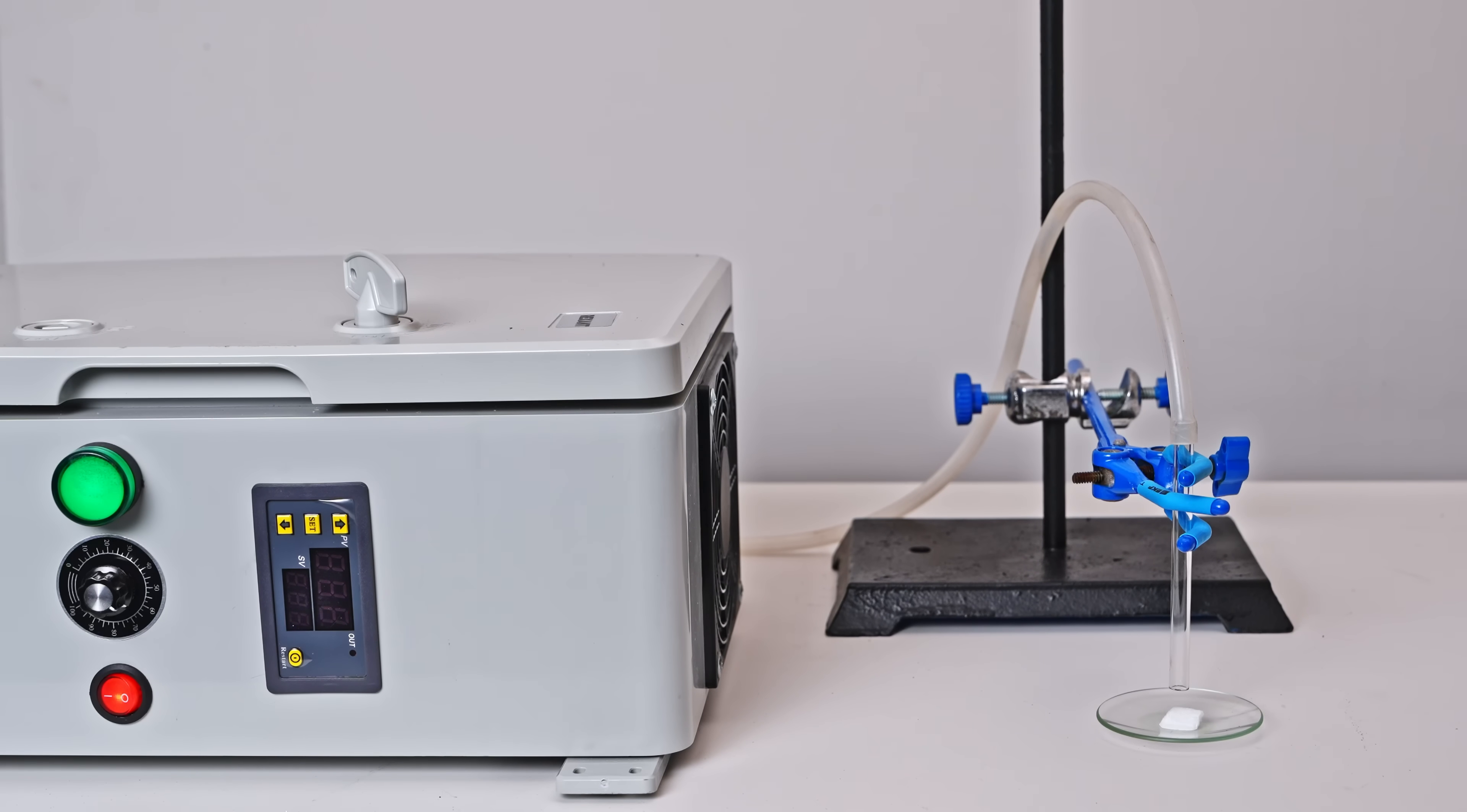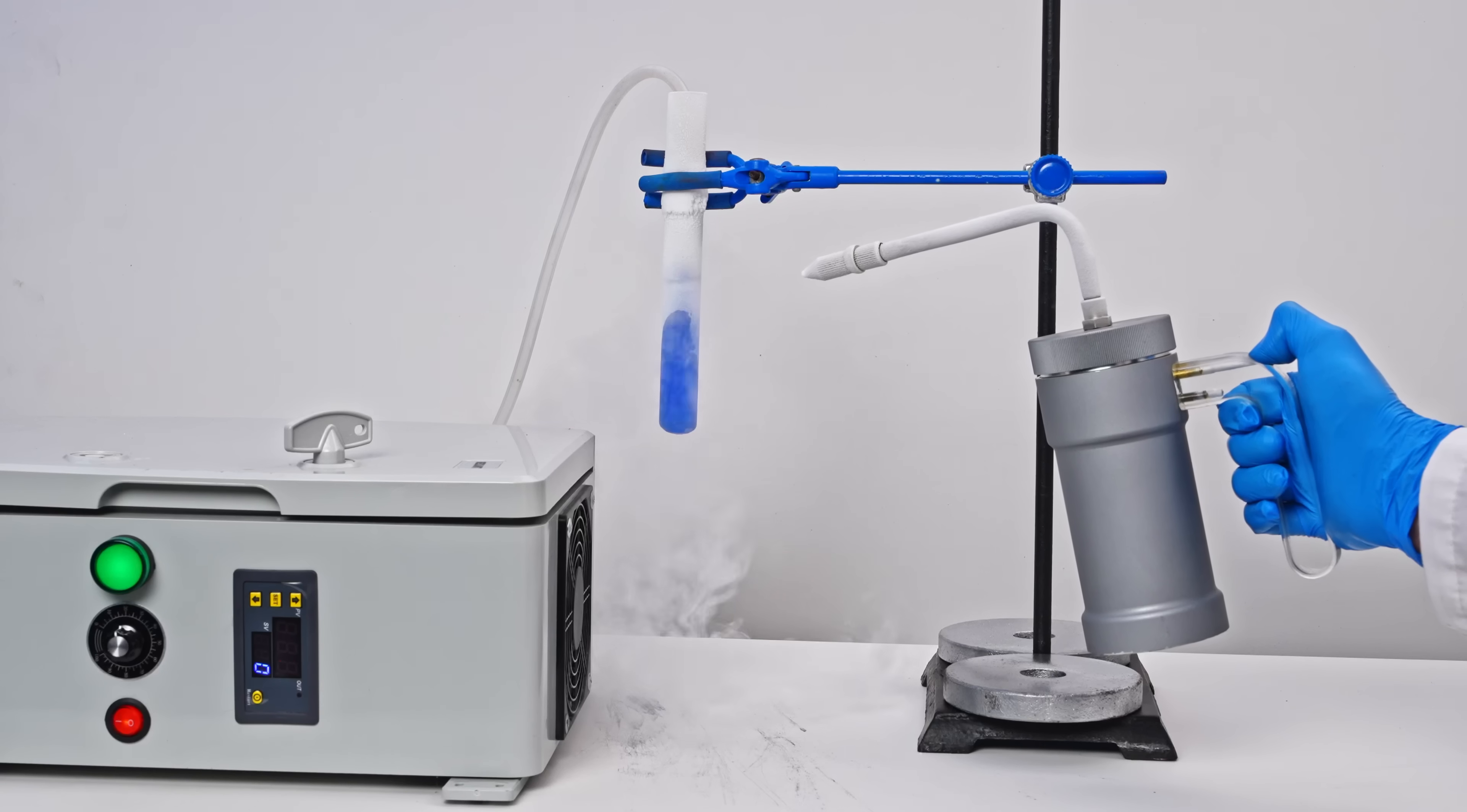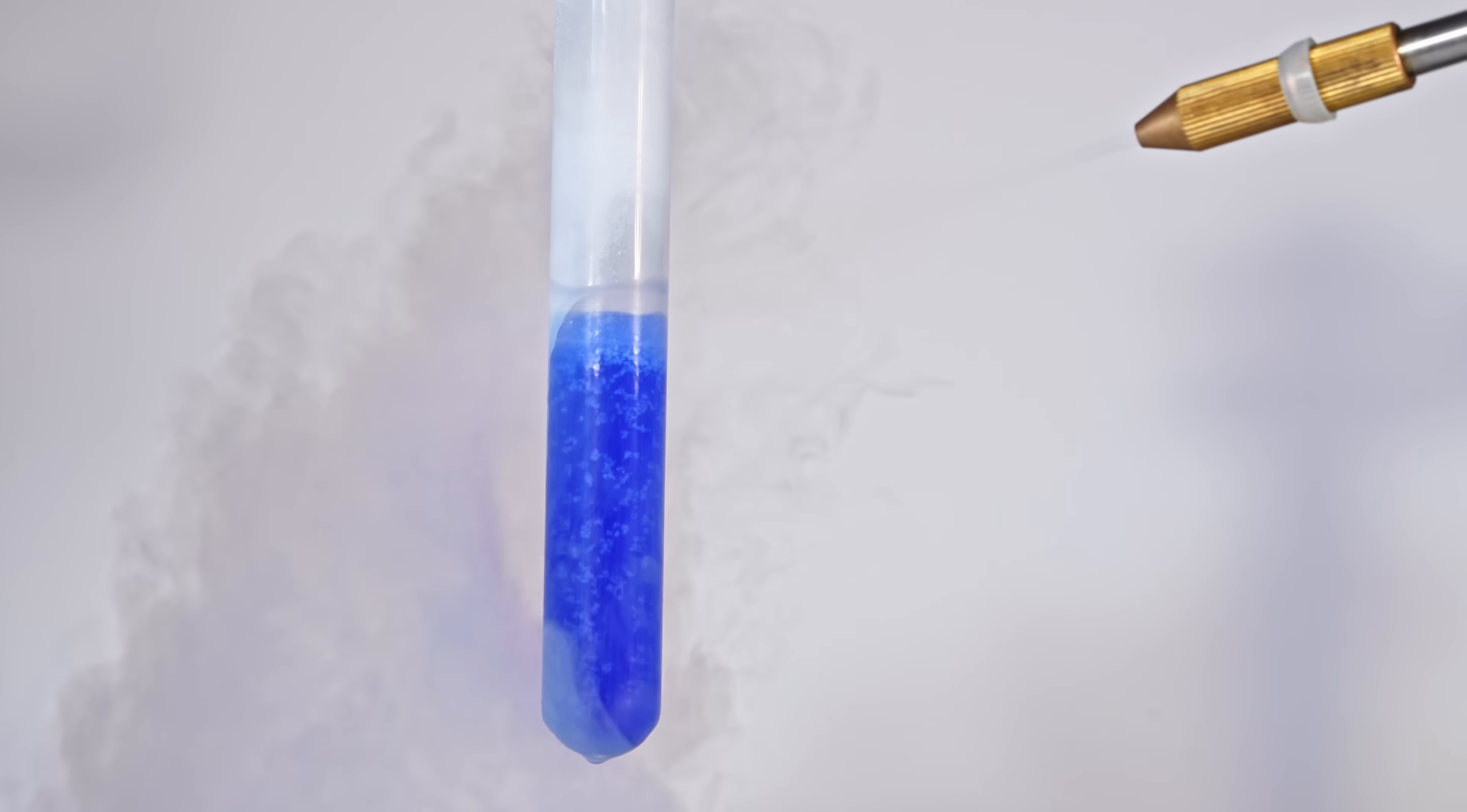Now I'm going to liquefy the gas and add it to the solid acetylene. Liquid ozonated oxygen has a blue color. The higher the concentration of dissolved ozone, the darker and richer the blue color. On this watch glass, there's a small amount of solid acetylene, and now I'm going to pour some liquid ozonated oxygen onto it.